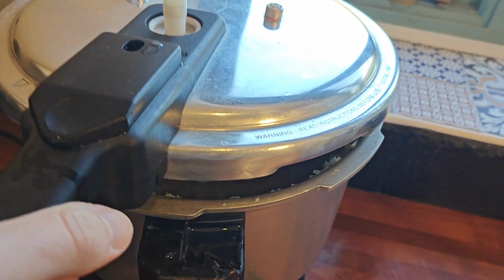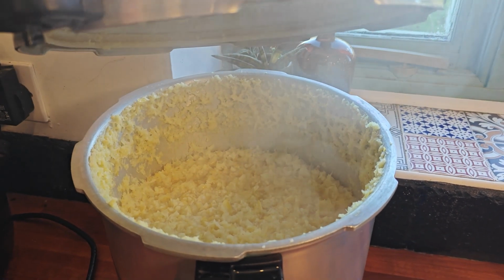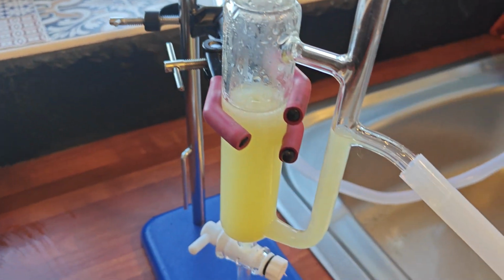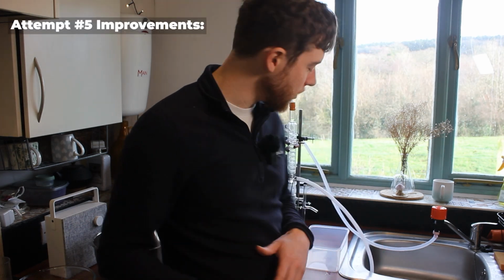You can see by looking inside here now that all the lemon was basically bubbling and boiling up the sides, and it was coming straight out this tube all the way around and down into the collection tube. So I think this is attempt number 5.